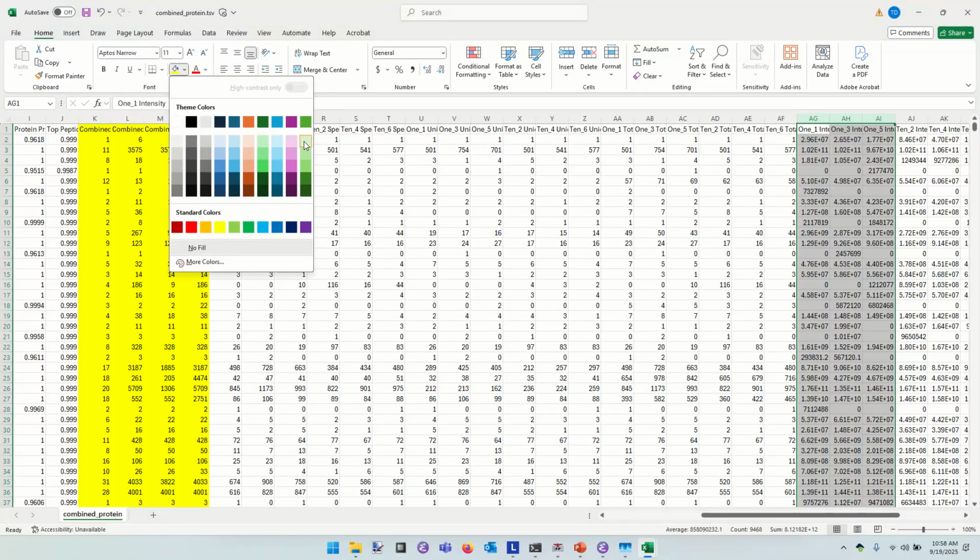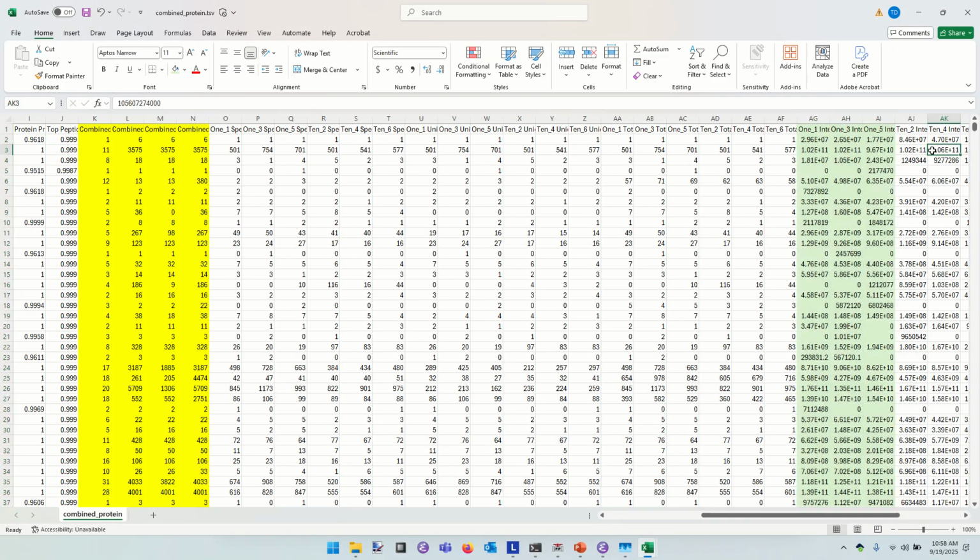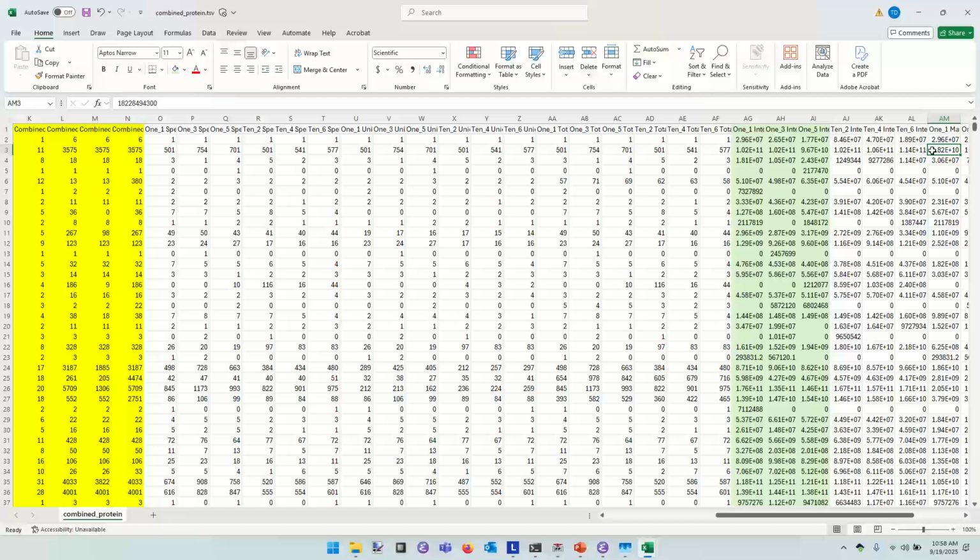It's not so important, but I think we have slightly different numbers. Yes, there are occasionally some random sampling things that go into these scorings. There are some machine learning routines that are used for deciding which spectra are identified and which are not.